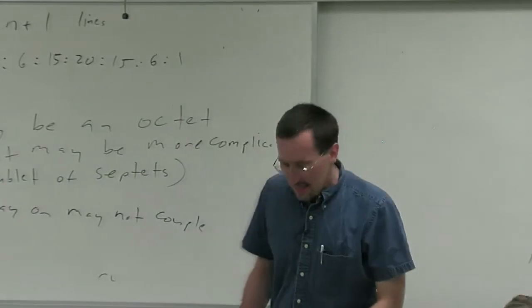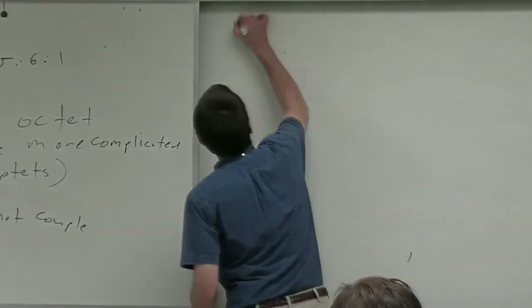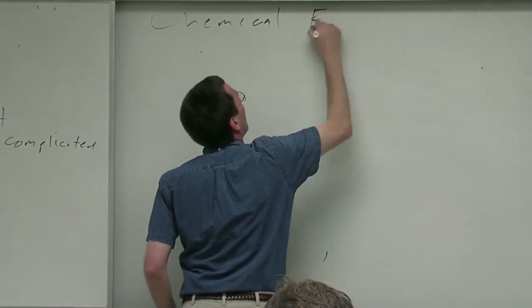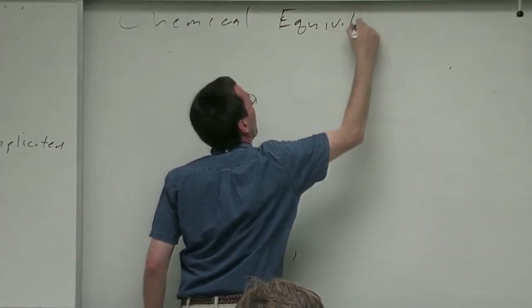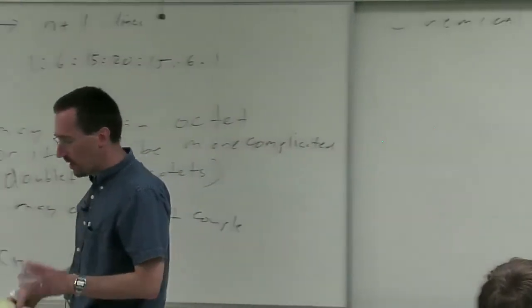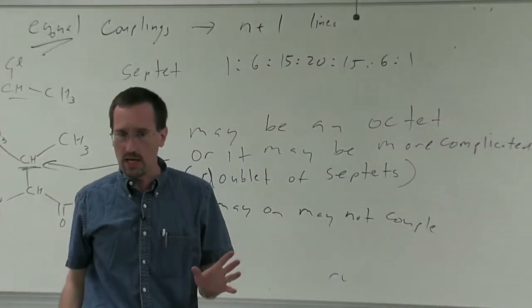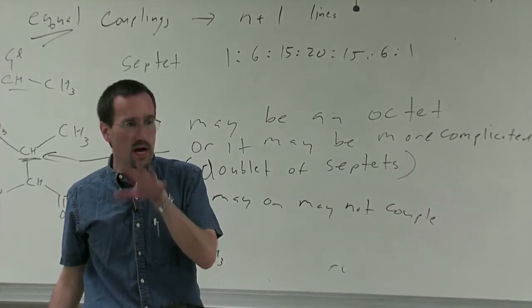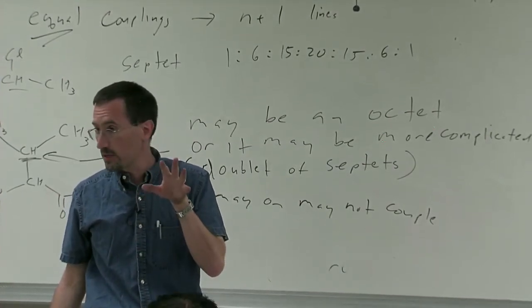All right, let us now tackle the concept of chemical equivalence. Chemical equivalence is the first level of sameness that I was talking about. Remember I said that protons only couple to other protons if they are different?